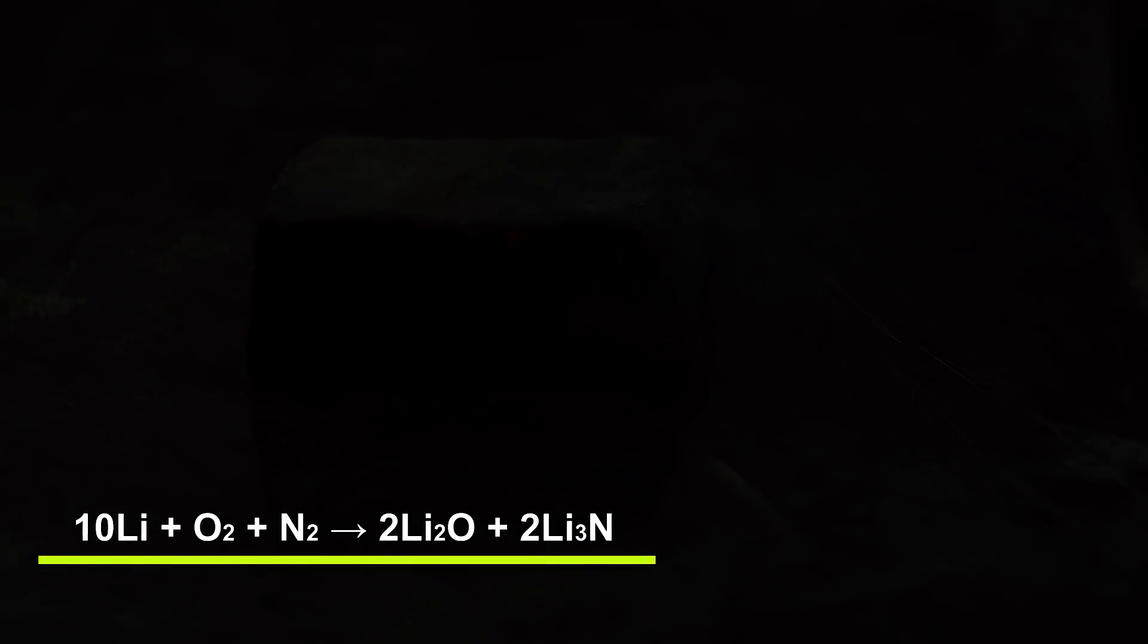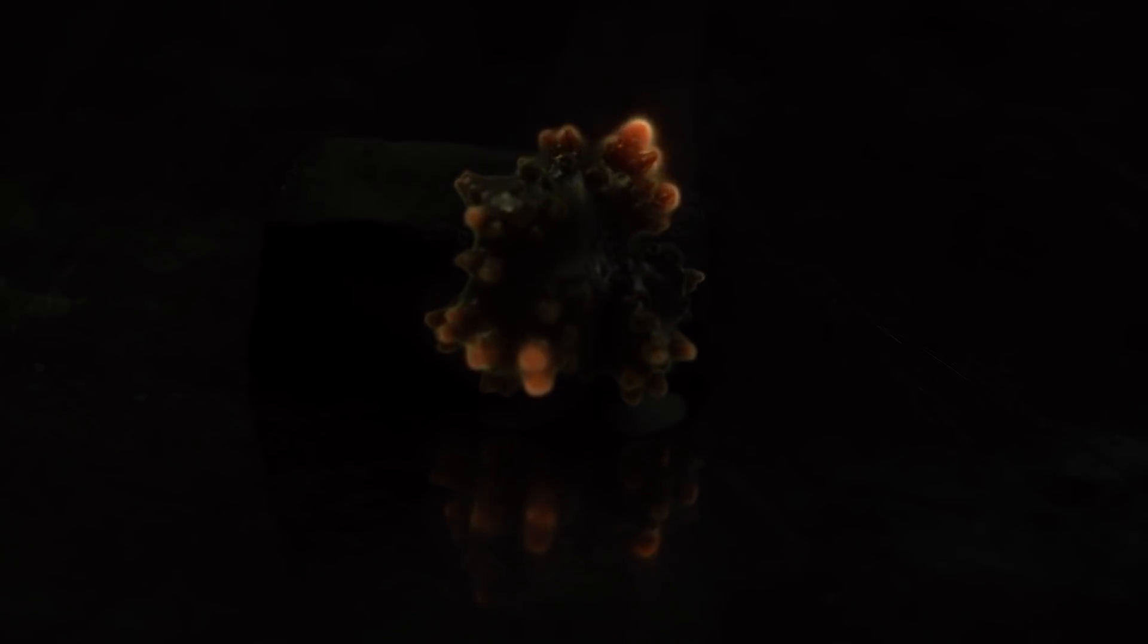Before I show you the reaction, I'd like to demonstrate how lithium burns on its own. It's nice and maybe you've never seen it before.